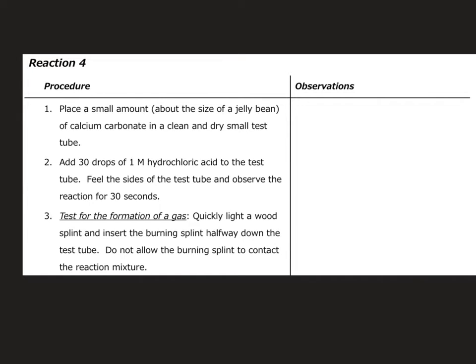Hey guys, just some tips on the classifying reactions lab. Let's look at question or reaction number 4. It's real important that you write down your observations, and that means everything.